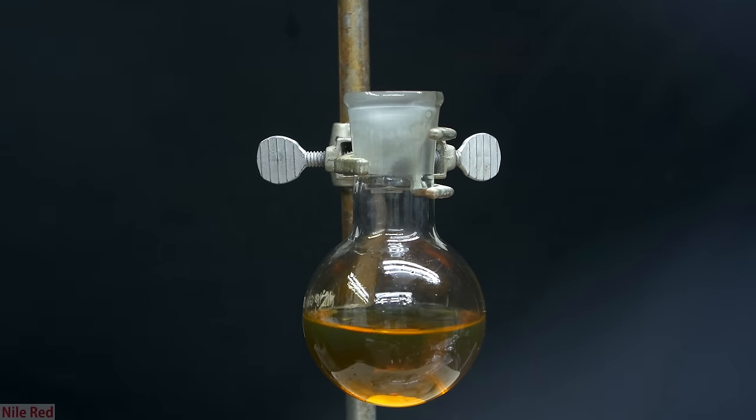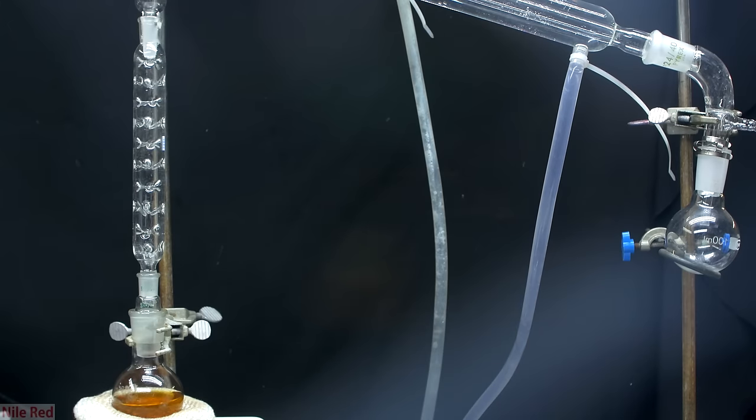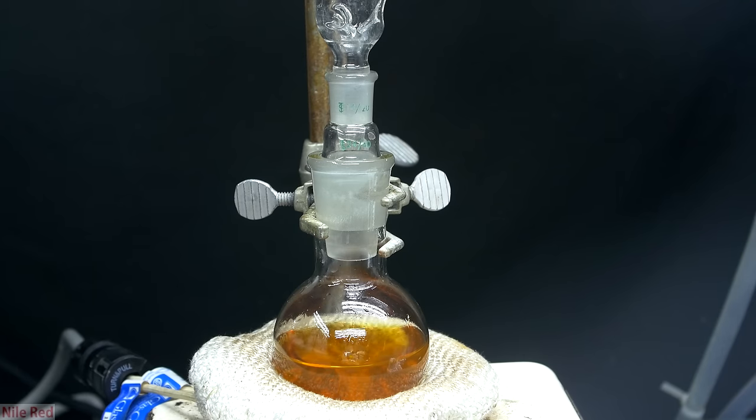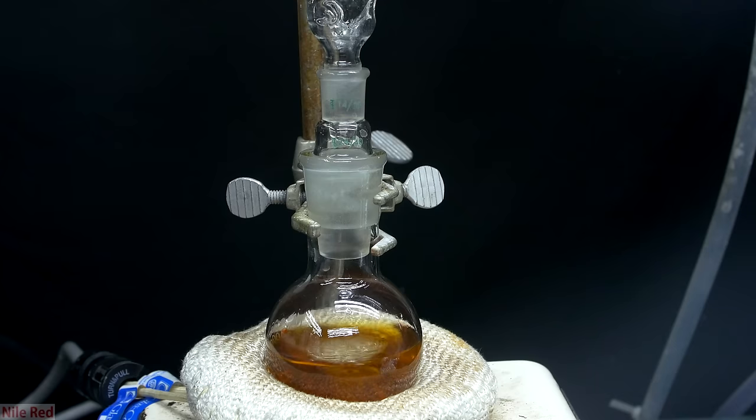I dropped a stir bar into the distillation flask and I set it up for fractional distillation. I wasn't able to fit the entire apparatus in one shot, so to show you guys the whole thing, I split it into two separate shots. To get things started, I turned on the heating mantle and the stirring, and very shortly afterwards, things started to boil.